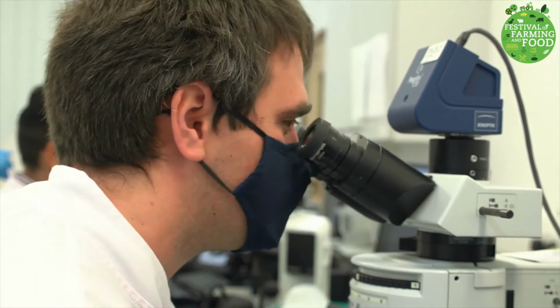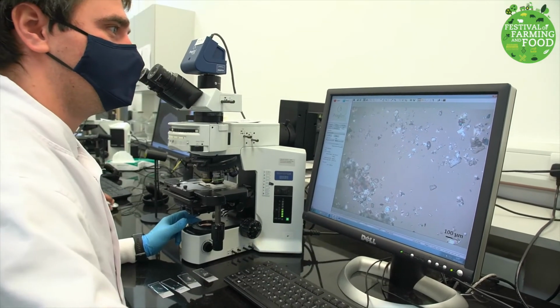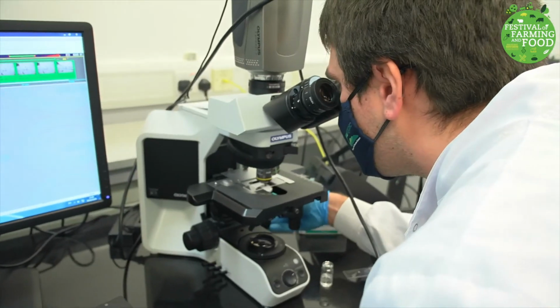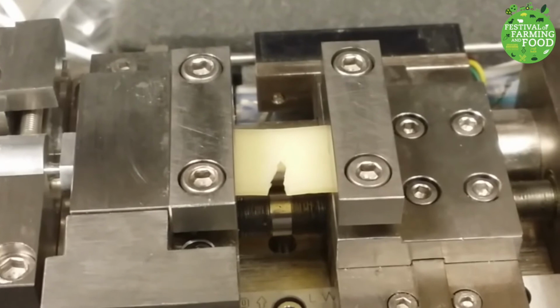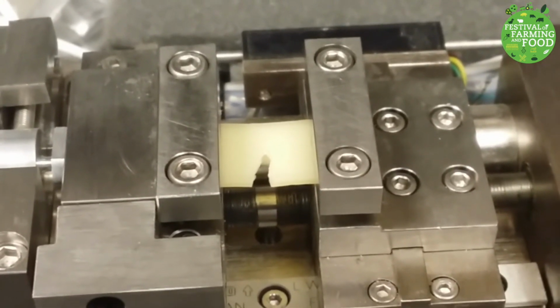Here at the National Food Imaging Centre in Moorepark, we use state-of-the-art microscopes to look at the structure of food up close. We can look at the various ingredients, the size of particles, how they interact with each other, and how this changes the texture and functionality of foods. We can look at the microorganisms in our fermented foods and see their size and shape, see if they're alive or dead. We have specialised equipment we can attach to various microscopes so we can watch how the food structure changes during heating, cooling or mechanical stress. This process here helps us understand the breaking process of cheese when we eat it.